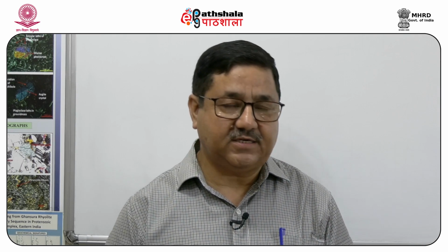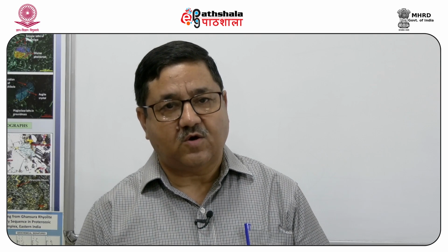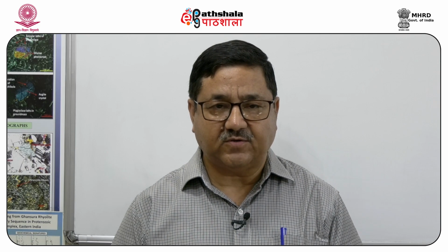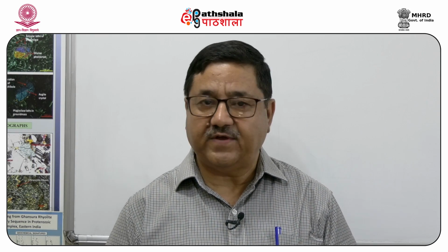However, there is a limitation to the polarizing microscope. The limitation is on account of the probe which we use. The probe in a polarizing microscope is light, which has a wavelength ranging from 400 to 700 nanometer. As we know, we cannot investigate beyond half the wavelength of any probe.